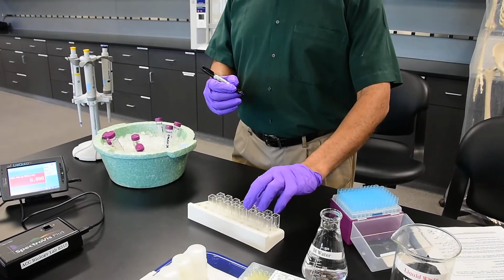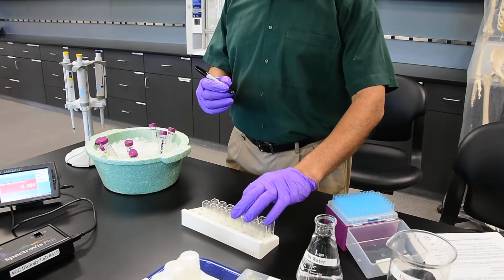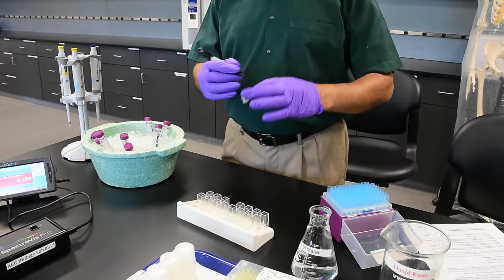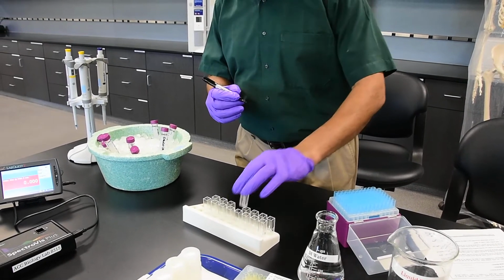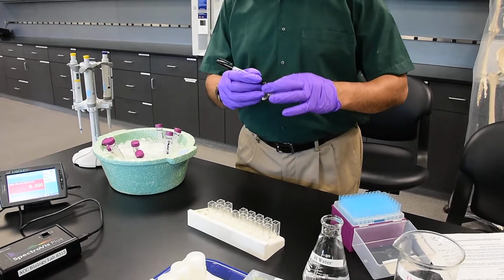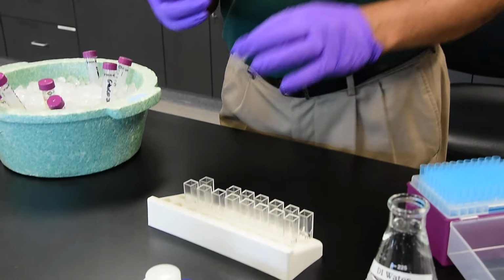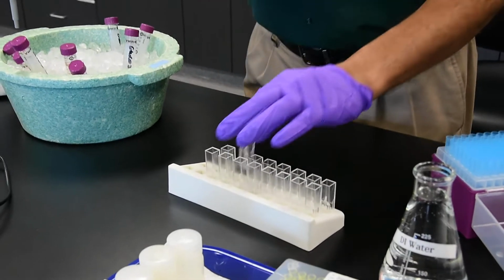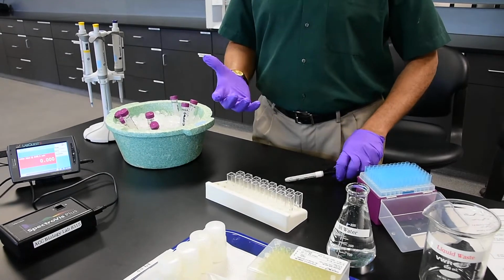So the concentration is measured in milligrams per deciliter. So we're going to go from 60 to 30 to 15, 7.5 and so on. Each time you dilute, the concentration is going to become half, so the dilution factor is 2.